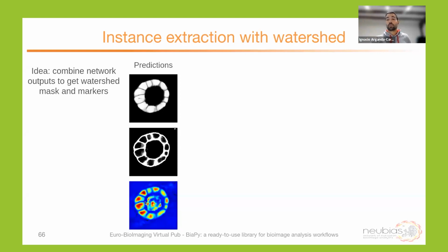It could be, for example, the regular distance to the borders, which again is not perfect. You see that inside the cyst, in this case, there are some distant values that shouldn't be considered. But still, the representation is quite good in the cells.